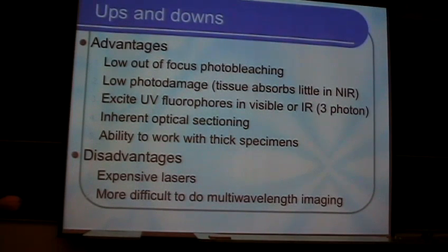So to summarize, there are certain advantages and disadvantages from the point of view of two-photon fluorescence or multi-photon fluorescence microscopy as compared to the confocal microscopy. And so, as I mentioned before, one important advantage is that we have the ability to work with thick samples, because the scattering and absorption losses of excitation light are much smaller.